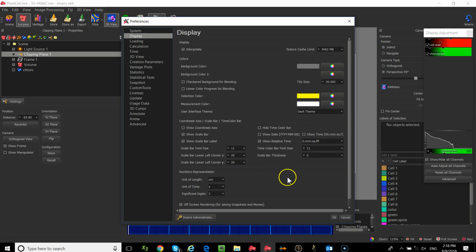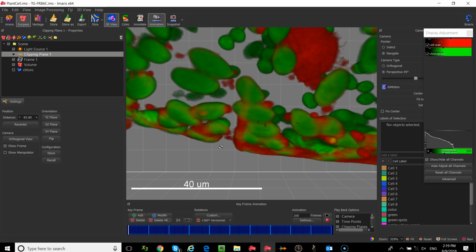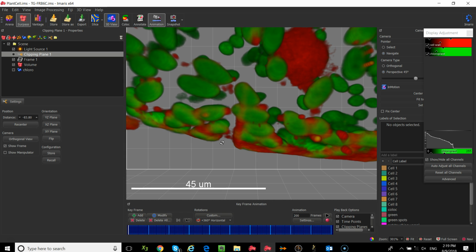So when you said you're going to make it larger or smaller, then you still have 20 microns there, but... No, it doesn't. It changes the value. So as I make it bigger, it will change. Oh, okay, I see. And you can also make the font size bigger by clicking and dragging, so it's a little bit easier to see. But no, that scale bar will change. It will also change as you zoom. So if I'm in navigate mode, you'll see that as I zoom in and out, because you're now looking at a structure at a different zoom level, that will also change with you.